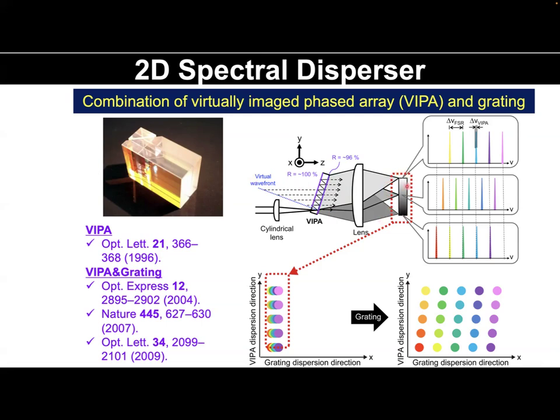of the output light at each vertical position of the optical Fourier plane. For example, at the bottom vertical position, the optical spectrum, like here, showing multiple resonance transmission peaks appears with a constant frequency spacing equal to the FSR, which is similar to the spectrum of the usual Fabry-Perot étalon.